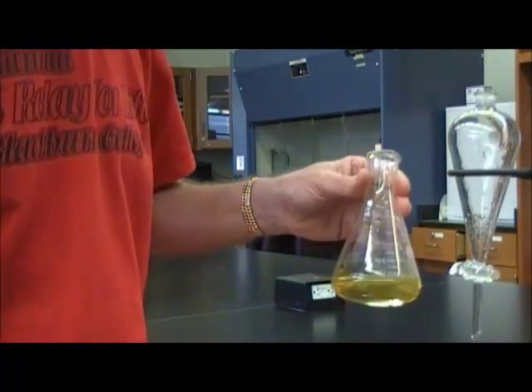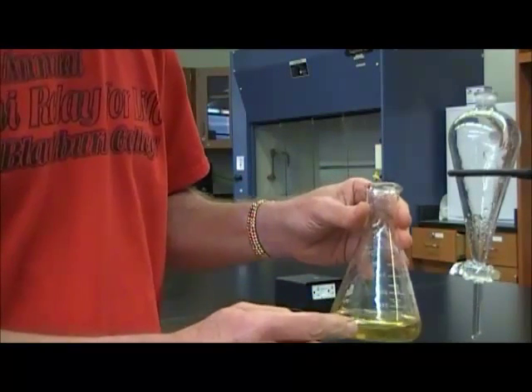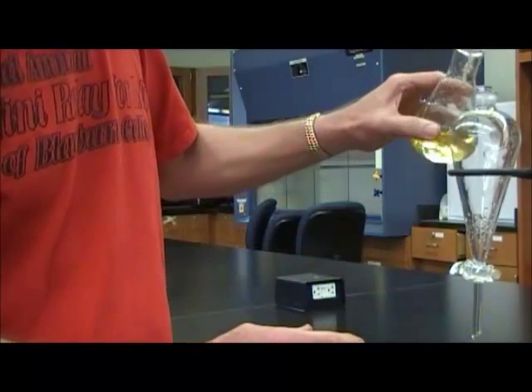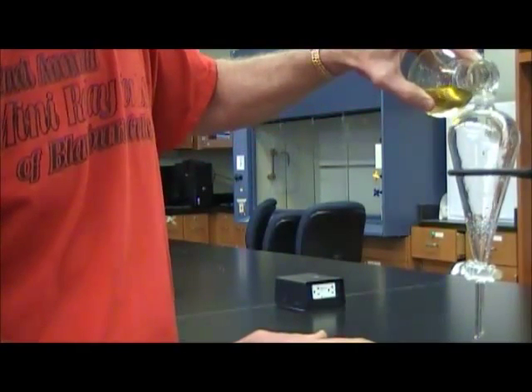Now, you may notice that there's still some yellow color to the water here. It should be clear, so what that suggests is that there's still a little bit of iodine dissolved in the water. I'm going to pour it back in and see if we can't extract that last little bit of iodine out of the water.